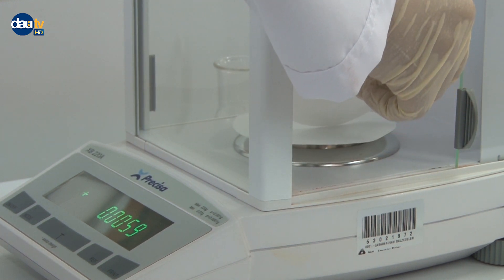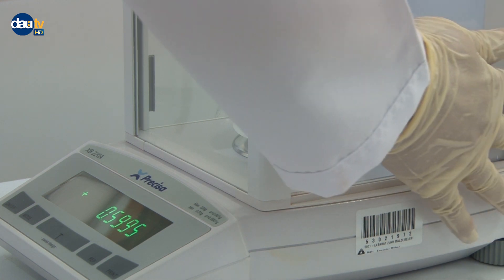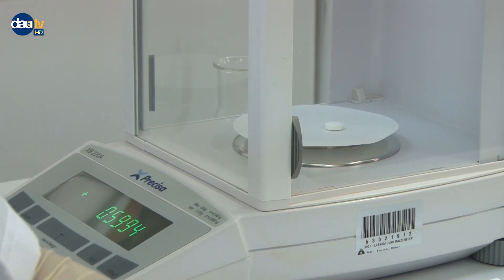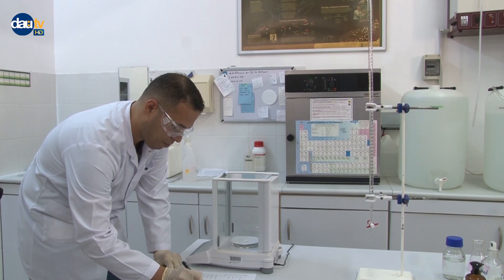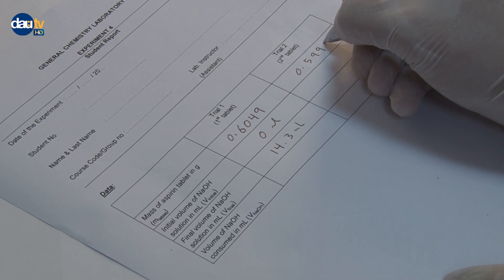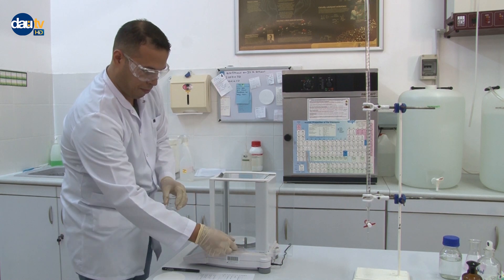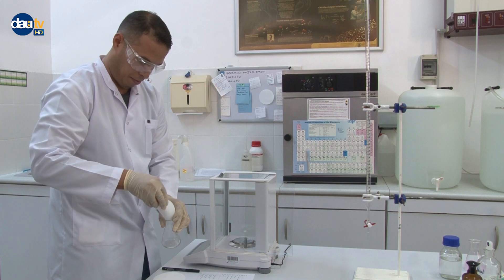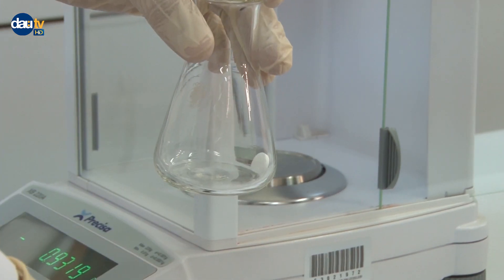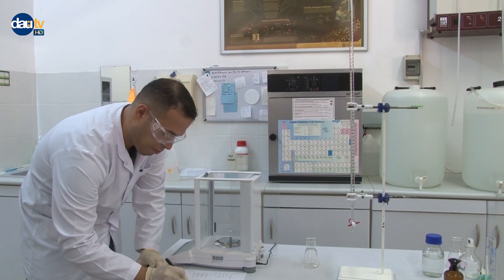Repeat the titration with the second tablet provided. Make sure that you use a new Erlenmeyer flask rather than the one you used for the first tablet. Do your calculations as instructed in the report section.